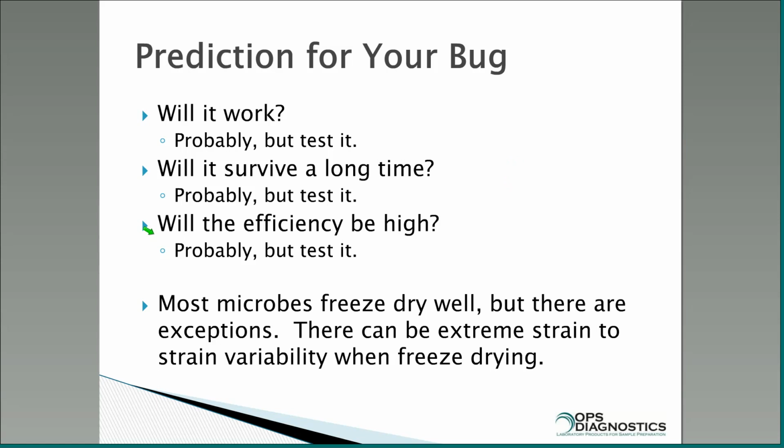Probably, but once again, you've got to test it. As simple as I can put this, most of the microbes are easy to handle. They're not a big headache, but there are always going to be exceptions. As I mentioned, we did that big project last year with hundreds of strains, and there were a handful that were just nuisances, but there's just no way around it. Some are like that, and it's something to do with the biochemistry of that particular strain. It was all the same species, just different strains.